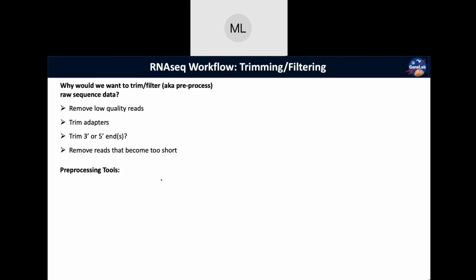Another overview statement about FastQC: it's not a problem if any individual module fails. Some of those modules are supposed to fail based on your data. You can imagine what we're talking about right now. The sequence duplication levels for amplicon data would be extremely high, and they should be, and that's normal. FastQC is a general tool, and not everything failing is necessarily a problem. It's always important to look at what your data is and what the module is telling you.